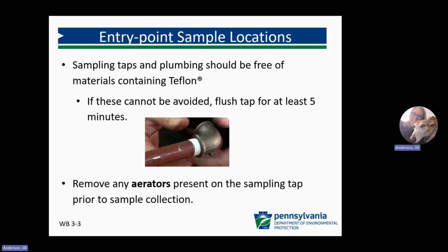Sampling taps and plumbing should be free of materials containing Teflon, such as Teflon tape at plumbing joints. If these cannot be avoided, ensure the tap has been flushed for at least 5 minutes. Be sure to note the presence of Teflon materials in the field notebook.